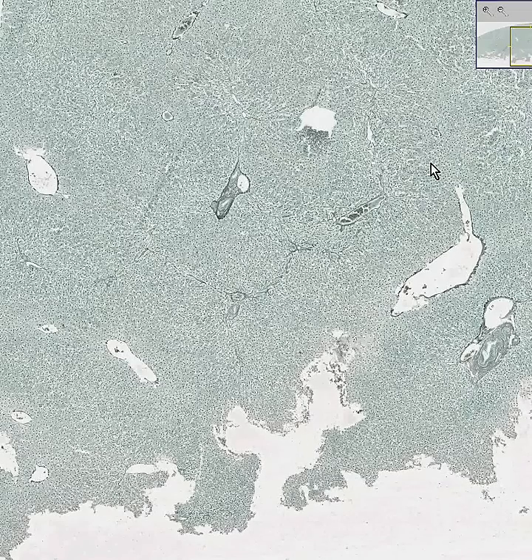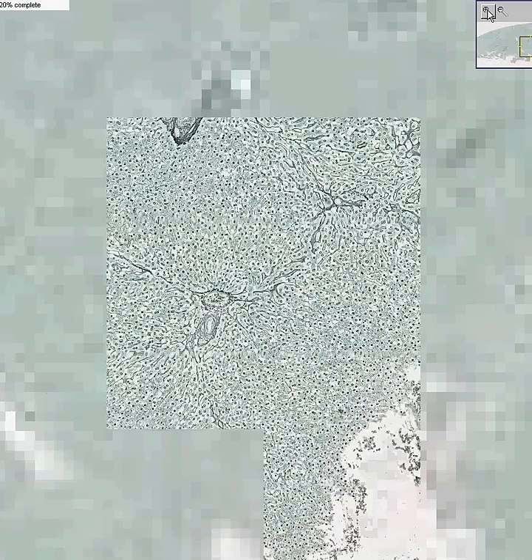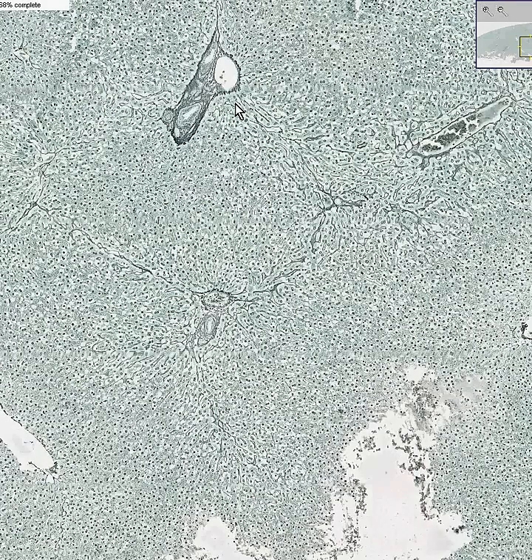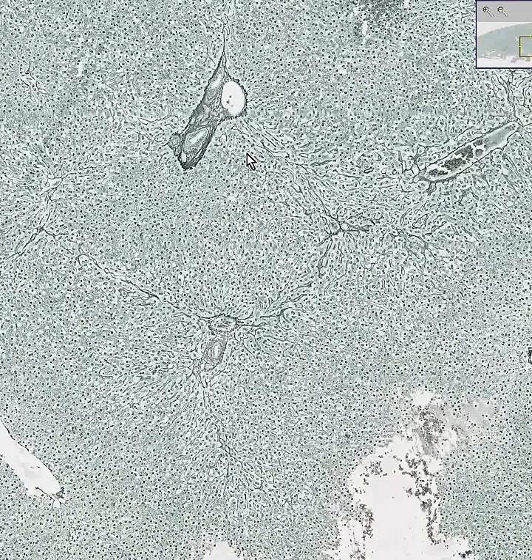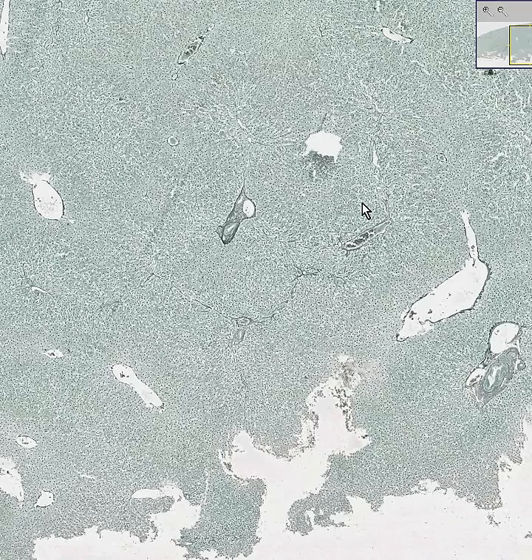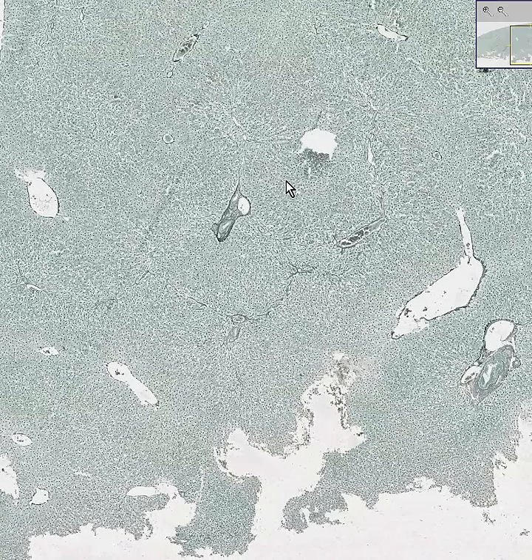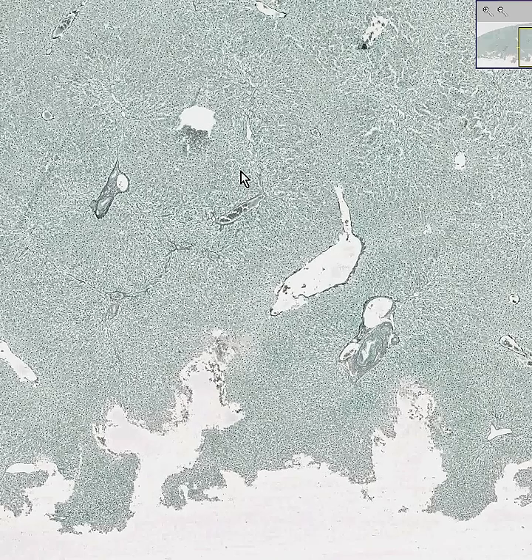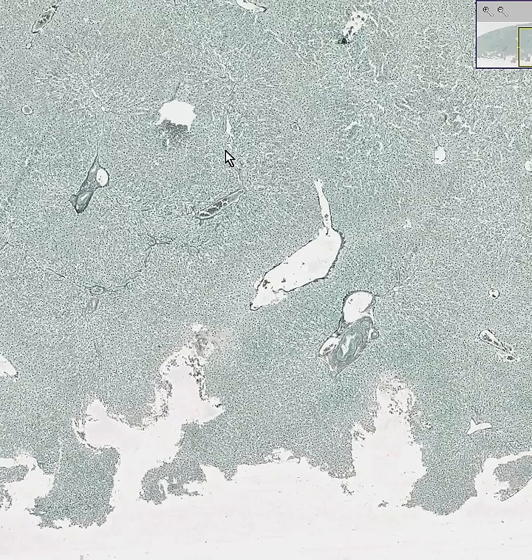Here is another super quick picture of the liver with a special stain to show you how reticulin fibers are distributed throughout the liver. Do you remember when we saw the original picture of the liver, we said there was only connective tissue of any significance in the portal areas?